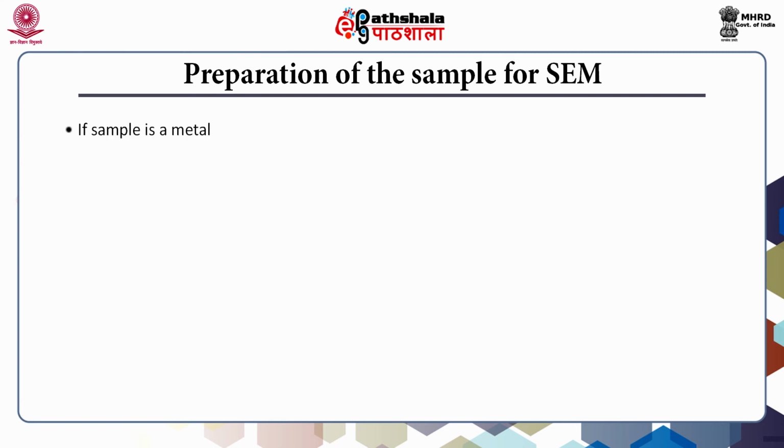In addition, it is required that all samples are able to withstand low pressure inside the vacuum chamber. In case the sample to be observed under scanning electron microscope is a metal, no preparation is required because metals are conducting in nature.